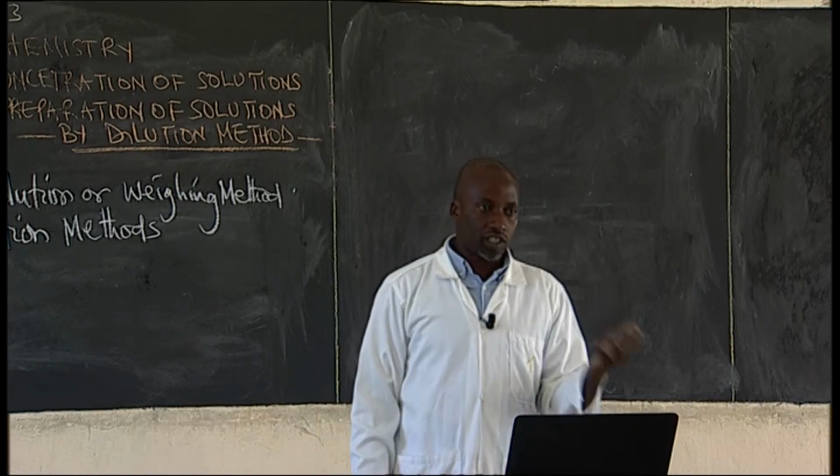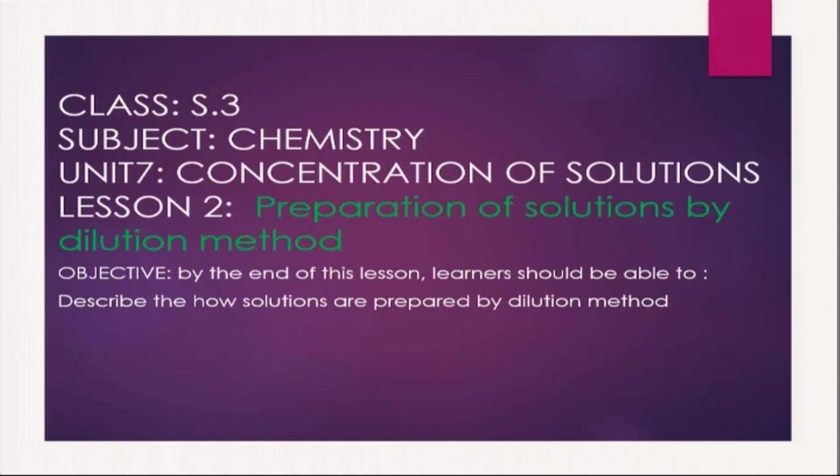So by the end of this lesson, please, dear students, I expect you to describe how solutions are prepared using the dilution method. How can you prepare solutions of specific concentration by using dilution method?